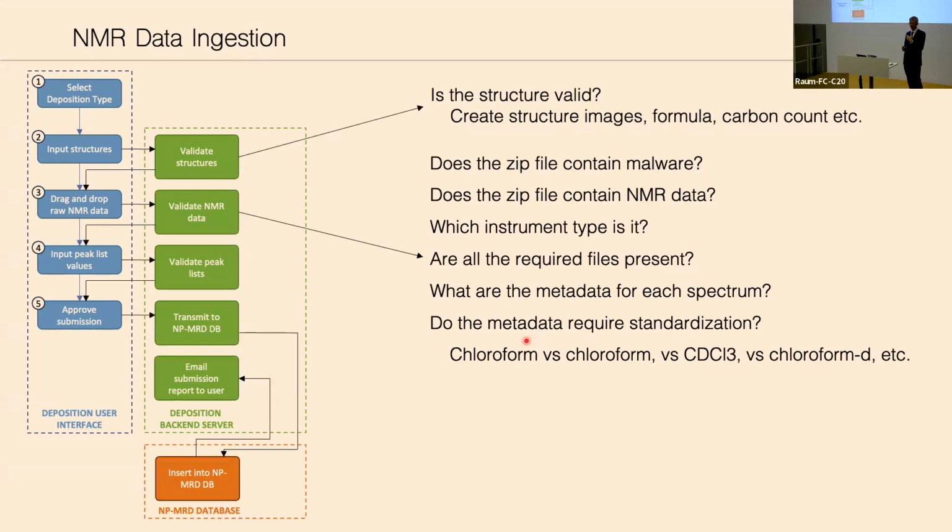Actually, all that information is in the metadata file that's with the data. So we don't ask users to do any of that. But in order to extract all those data, we need to be able to do that consistently from those files, even though some of those fields are sort of user serviceable.